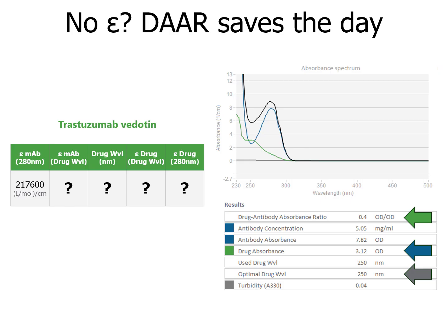And we also know that when we do method development, that we should likely look at 250 nanometers relative to 280 nanometers to understand the different concentrations of the antibody and the drug in this sample.